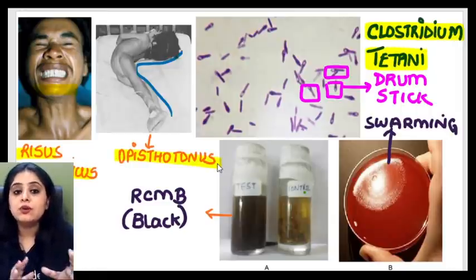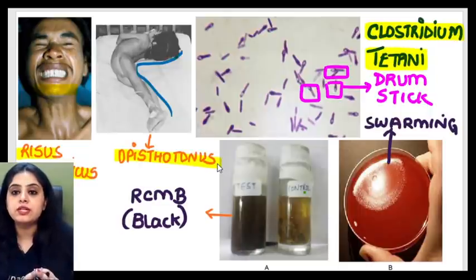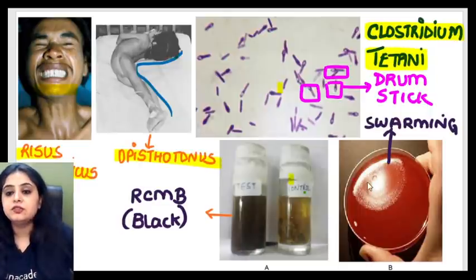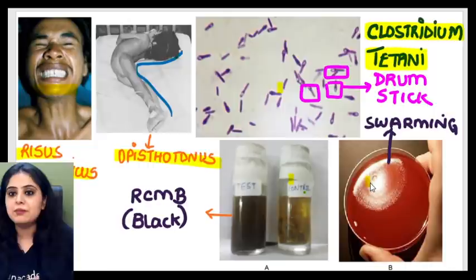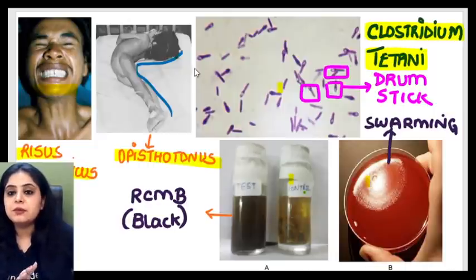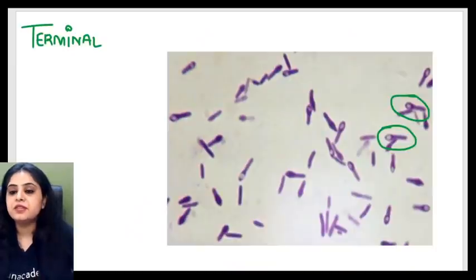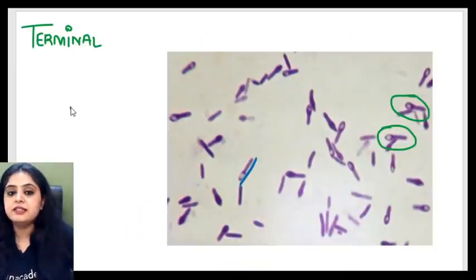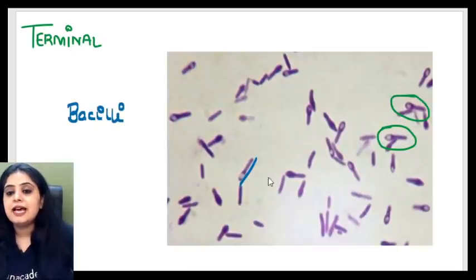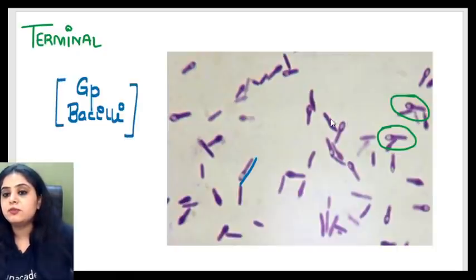Moving on to how the microbiology pictures correlate — we have three pictures. Let's zoom into each one by one. Looking at the first image: first and foremost, are they cocci or bacilli? They are elongated, so they are bacilli, and they are blue-violet in color, so they are Gram-positive bacilli.